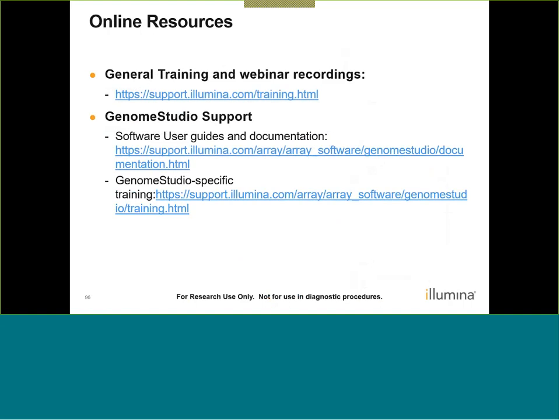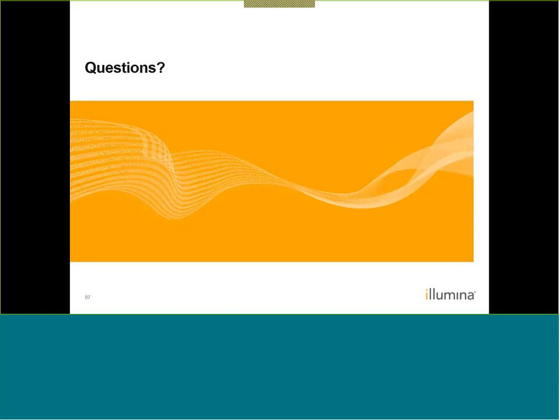online resources here. There's some general training and webinar recordings listed at this site, and also some support pages for the software. This is the link to the GenomeStudio software and documentation, and some GenomeStudio specific training videos and webinars. All right, and I'd like to open this up now to any questions that you might have.